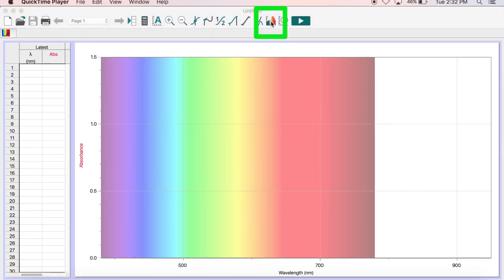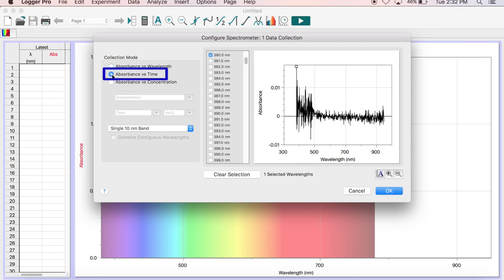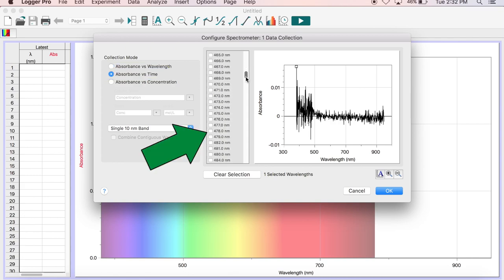To set up the spectrometer to capture absorbance data over time, begin by selecting the rainbow graph icon in the top middle of the screen. This will open up the Configure Spectrometer window. On the left, change the Collection mode to Absorbance vs Time, and then select your desired wavelength.